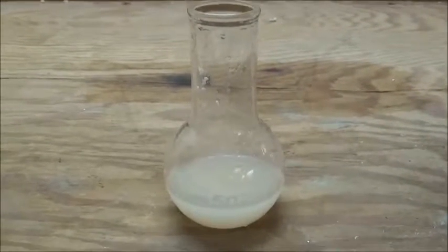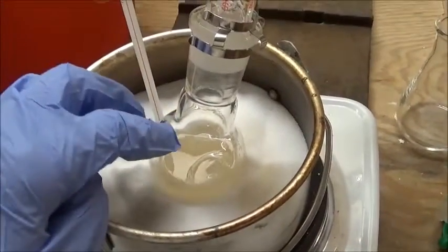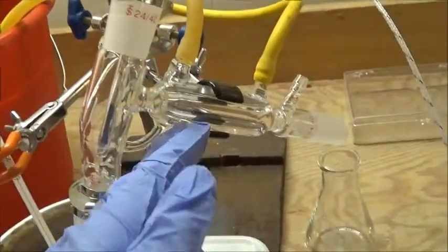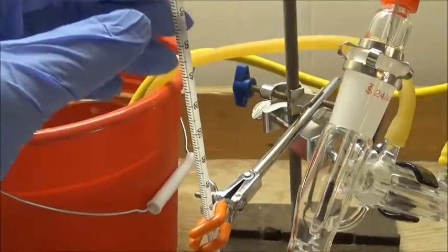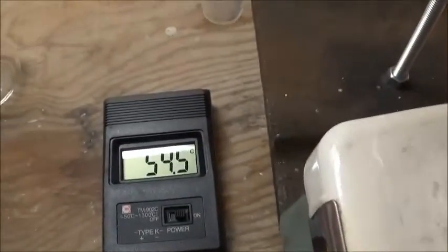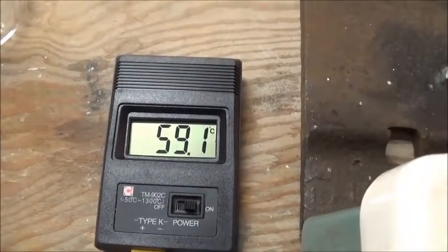I've just added a scoop of anhydrous calcium chloride to absorb the last of the water, and now I'll set up for distillation using a salt bath. I'm doing short-path distillation because ethyl salicylate boils at such a high temperature that a short condenser can condense all of it, and there are fewer losses since there's less surface area for material to get stuck. My highest-temperature thermometer only goes to 200°C, so I have a thermocouple in there as well. When the still head reaches about 230°C, I'll start collecting.